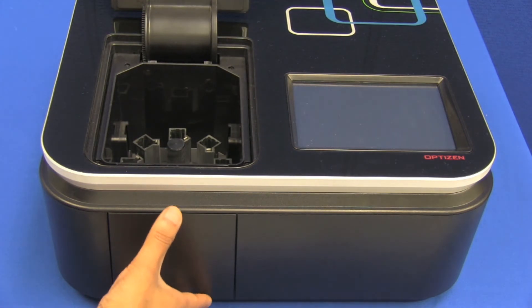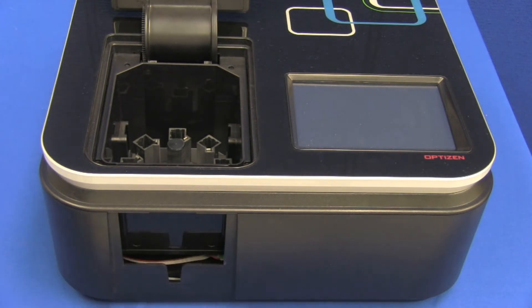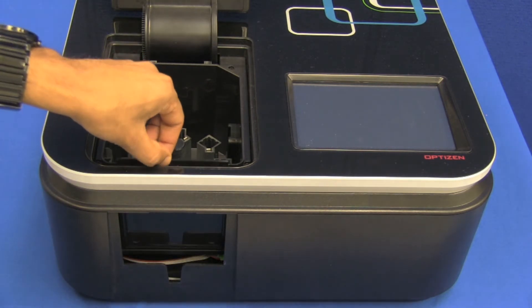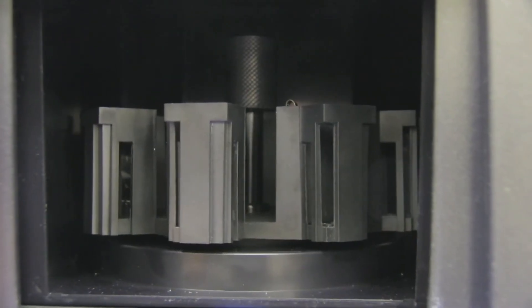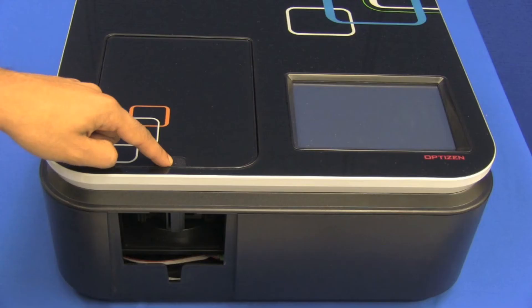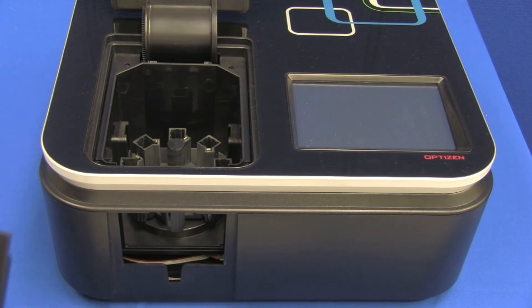In addition to that, you can see that there's a quick-release viewing panel here. You can quickly gain access to the inside of the instrument during operation just by looking through the front panel. Easily removed, easily reattached — really quite convenient.